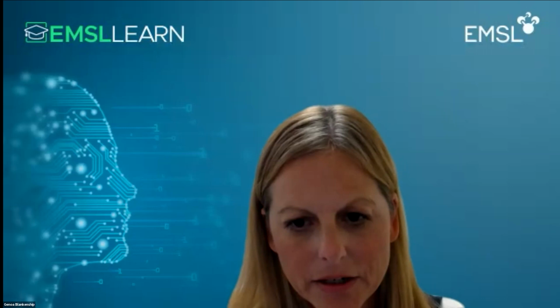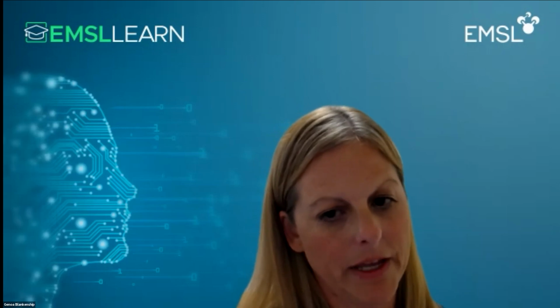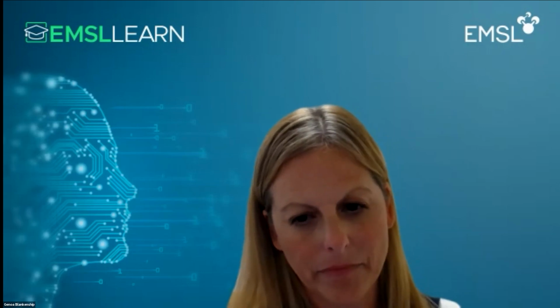Okay, great. Question from Leah Johnson. Is this only available to use if you have EMSL data, or can you use it for non-EMSL affiliated data? So this can be used for non-EMSL affiliated data, especially with its current state being solely as an upload of your own data. It's open for the public. The only requirement is that you have that Nexus login to access MAP.